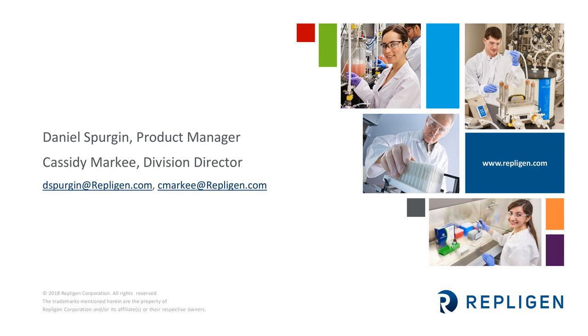It's quite difficult to estimate the amount of materials that you need to remove, and how long it will take specifically. So the best approach to that is to start with a longer period of time. Let's say maybe 24 hours or 15 hours, and then work backwards. And the reason is every application is different and unique, and many different parameters factor into that.